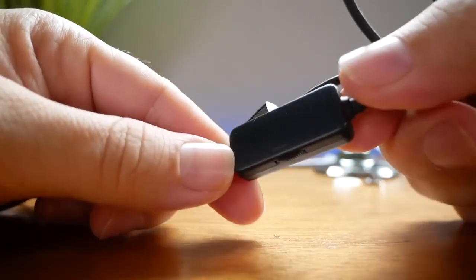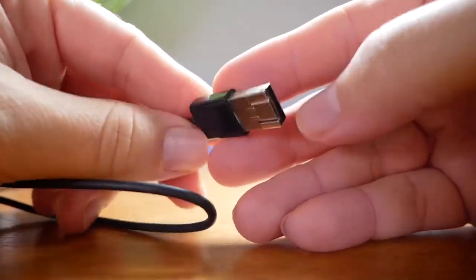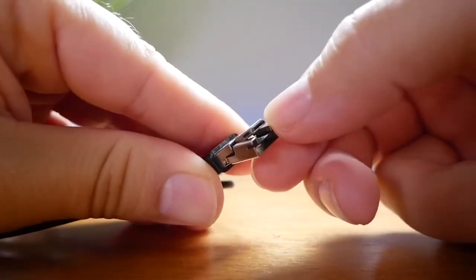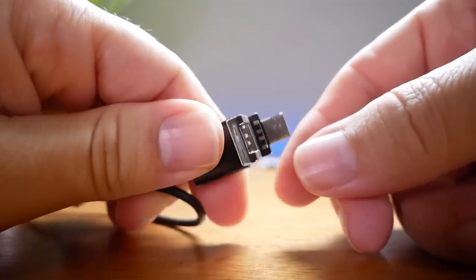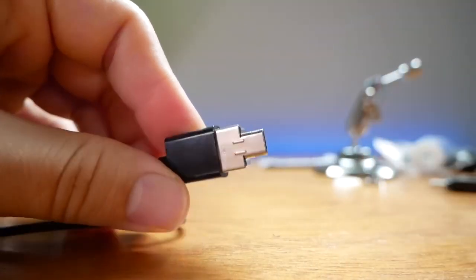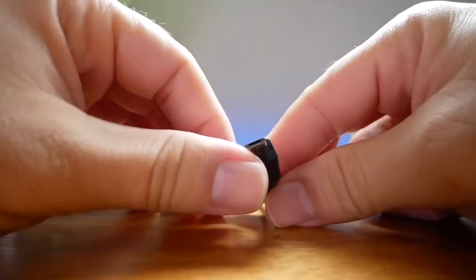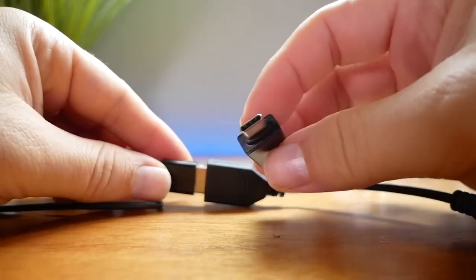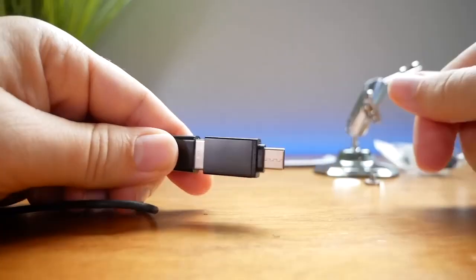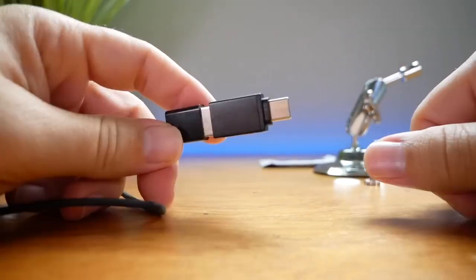There's a little controller that controls the brightness of the LEDs. At the end of the wire you'll find the USB plug, but this is not just an ordinary USB plug — it's a multi-function one. If you pry this down, you can see there's a micro USB that you could plug straight into a phone. You could also use the included adapter, or if you have a newer phone with USB-C, you'd use that adapter.